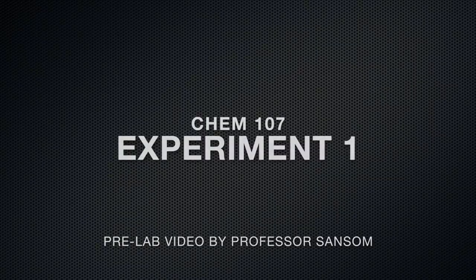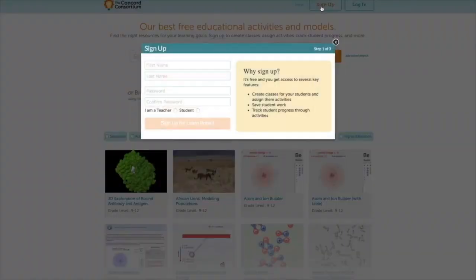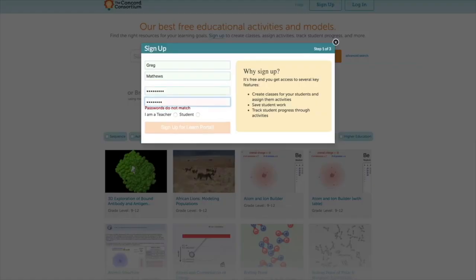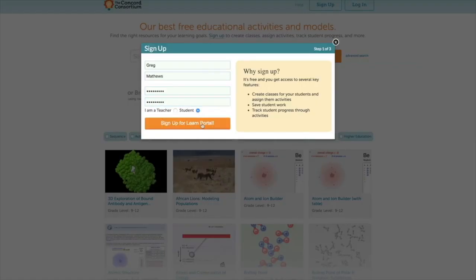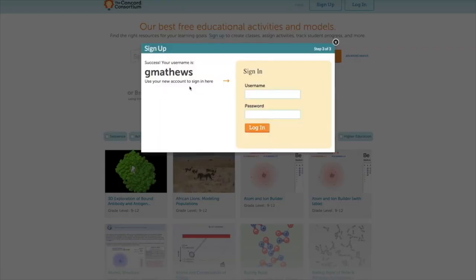In Part 2, you'll be doing Beer's Law with a spectrometer. To begin in Part 1, you'll need to make an online account at learn.concord.org. When you get to that website, click on Sign Up, then type in your name and your password that you've chosen, and select Student. Then click on Sign Up for Learn Portal. When you get to the next screen, enter the class code, which is CHEM107. After you've done that, it'll give you a username. Make sure you write that down in your lab manual.